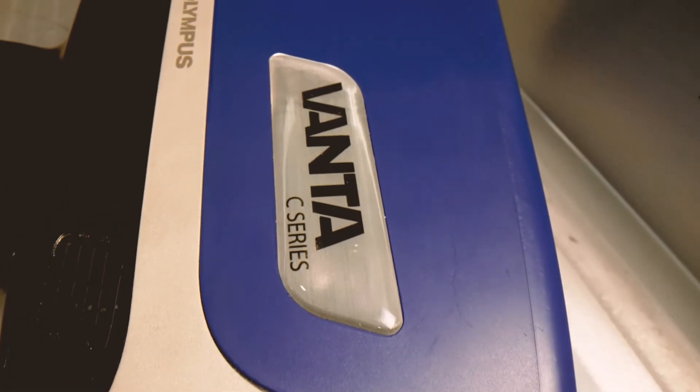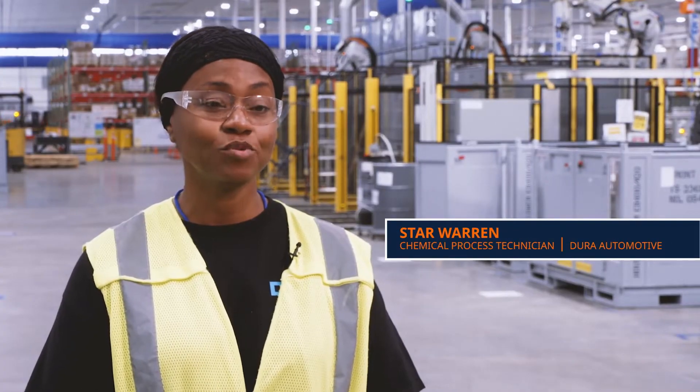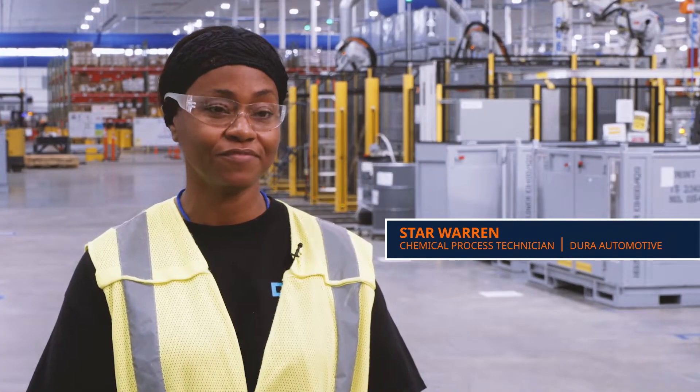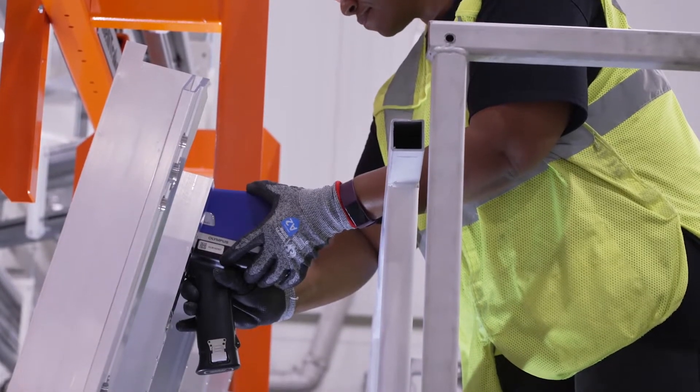The Vanta XRF gives us confidence in the product that we ship. My name is Star, I'm a chemical process technician for Dura Automotive. It's very important for day-to-day operations due to the requirements set by the company for the titanium layer and the ranges that we have to measure against.